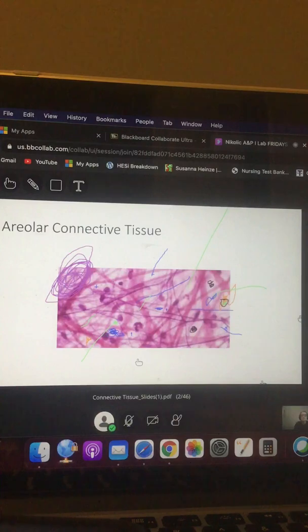Oh, somebody knows. Let me go see. Hold on. I'm coming back. I lost where I was. All right. Is it hyaluronic acid? Okay, I thought so. See? I know stuff. Anyway, so the ground substance, except for one slide, doesn't pick up a stain. So what that means is if I point to a space, what do I want you to tell me this is?